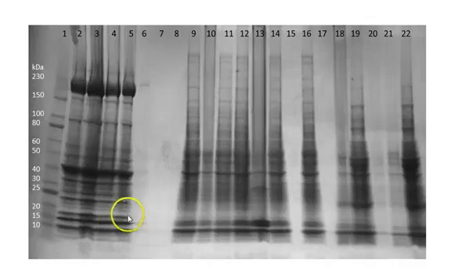Alright, this video is about how to interpret the protein gel. You've labeled the protein gel, now you want to talk about it in your lab report. We're going to be going over this in lab, but I thought it might be useful to have a document that you can refer back to.